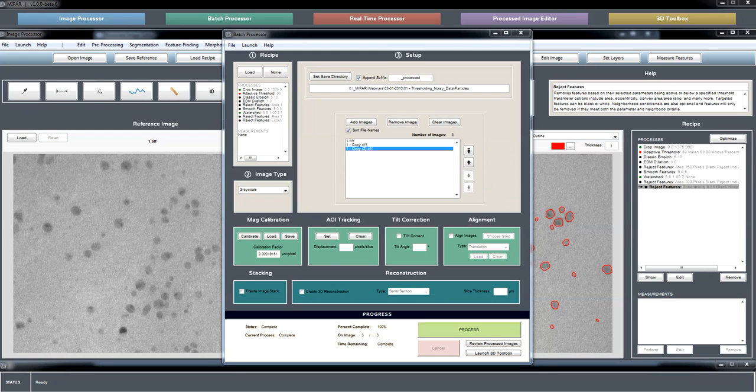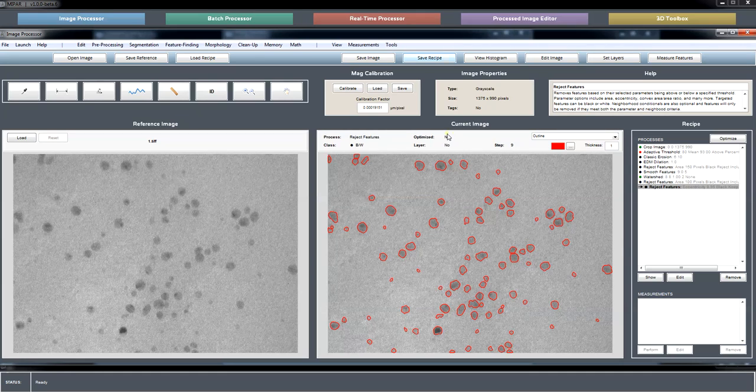Meg asked, could you bring back the scale bar, the original image at the end that included the scale bar, if you wanted to show it? I see. So Johan's suggestion there is a great one. If you could just burn back the scale bar onto your image, that would be great.